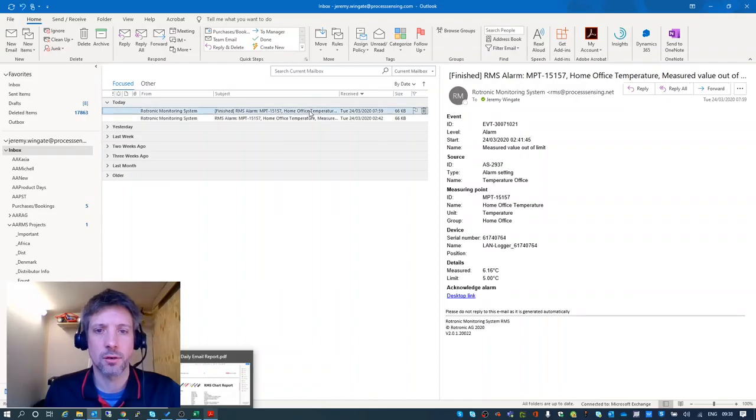In addition, I got an email this morning at 8 o'clock when that alarm ended. So that's very handy to know. You get a message that the alarm has obviously ended. So there we are, just having a look there.